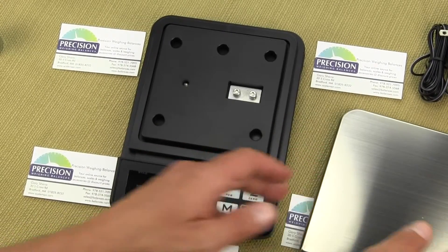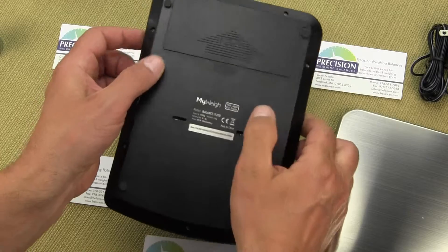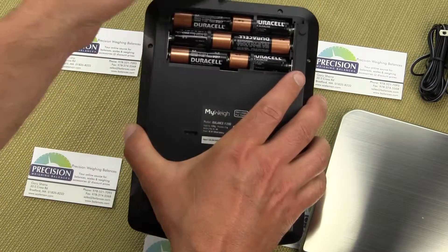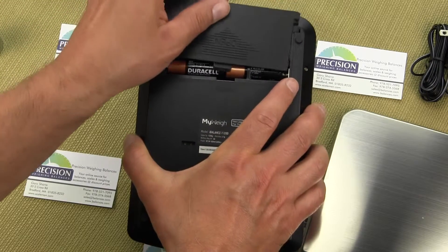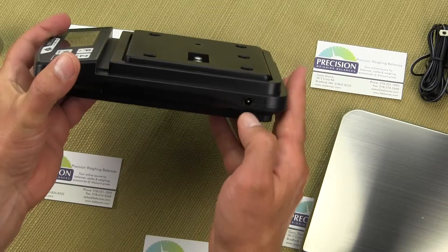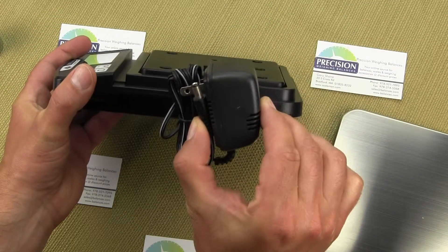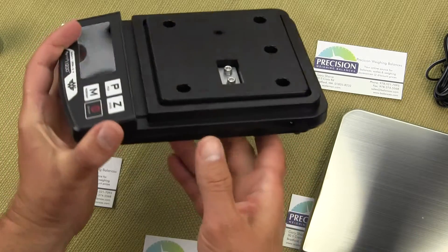The balance is simple to use and operates off of six AA batteries. The batteries do not come with the unit, or it can be operated by AC adapter. You can see the AC adapter port here, and MyWay includes an AC adapter with the i1200.